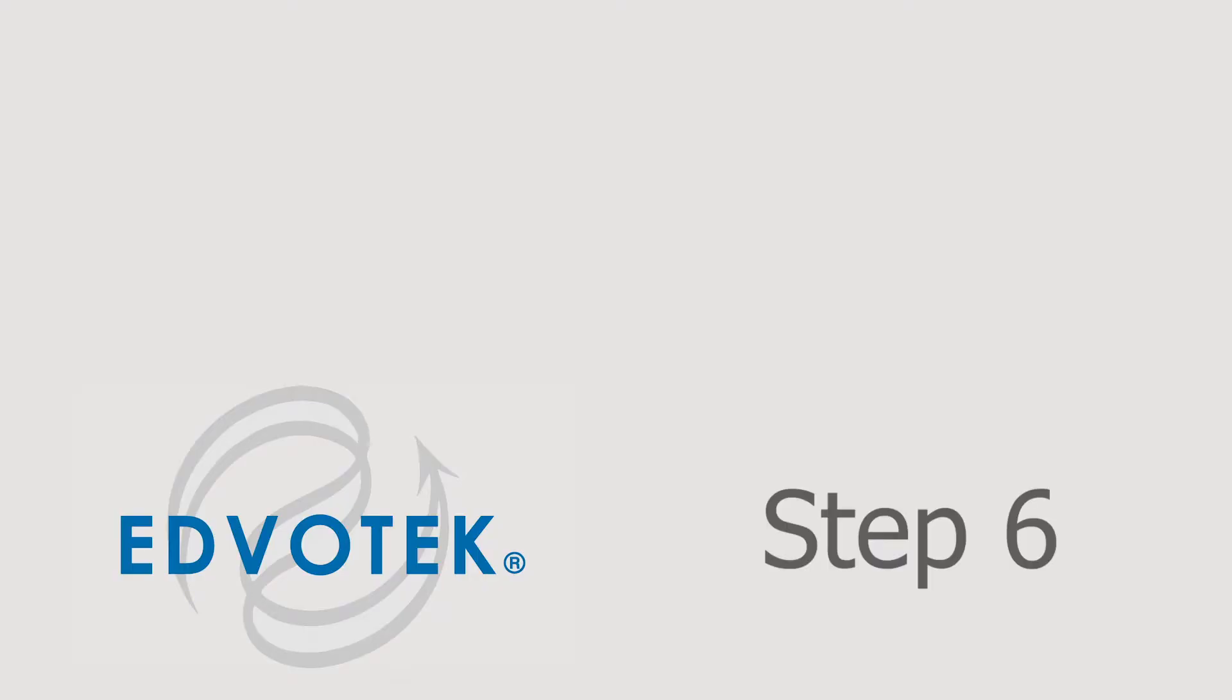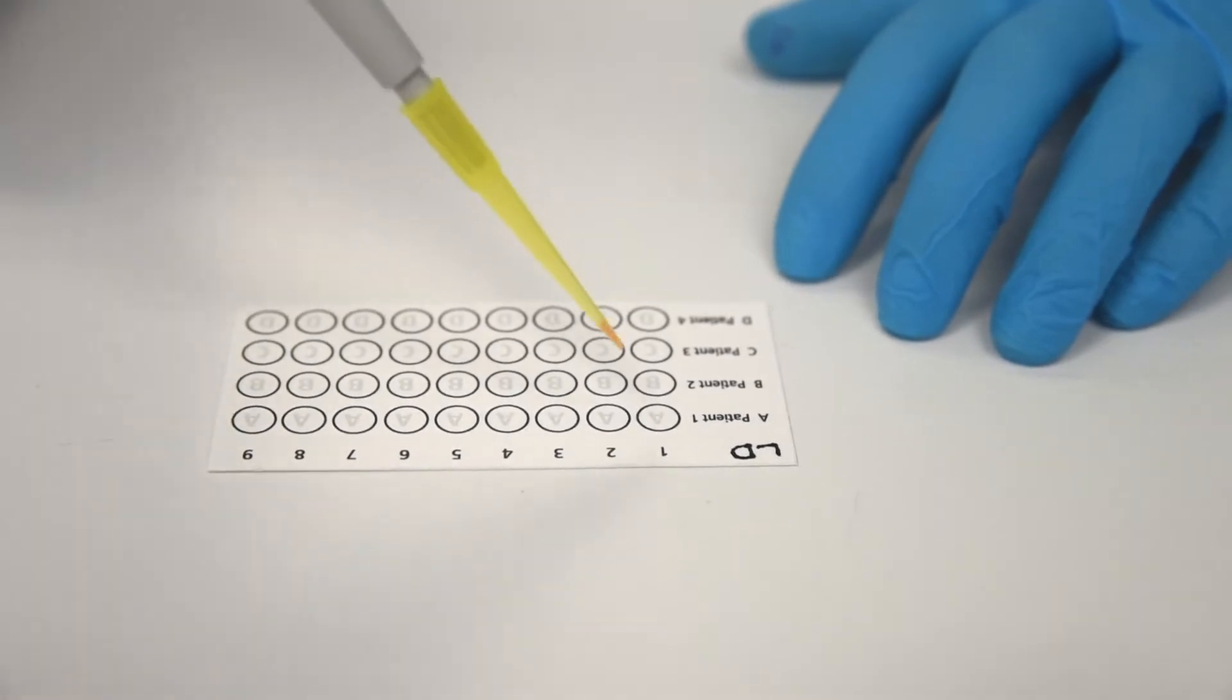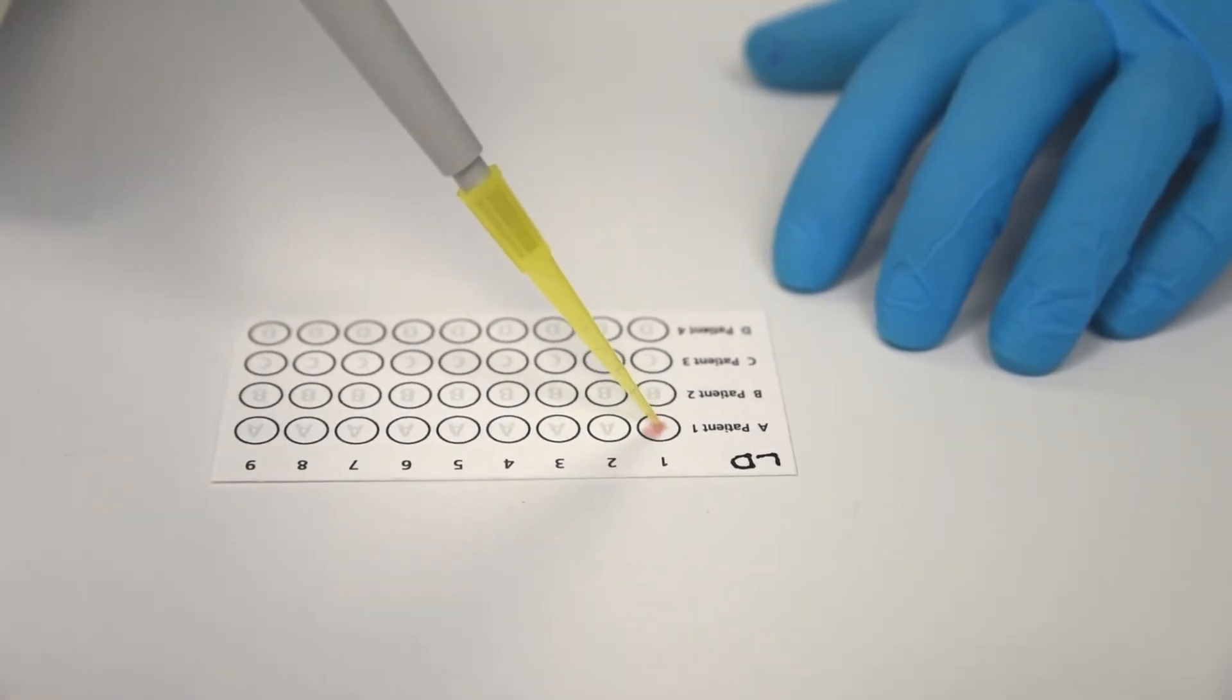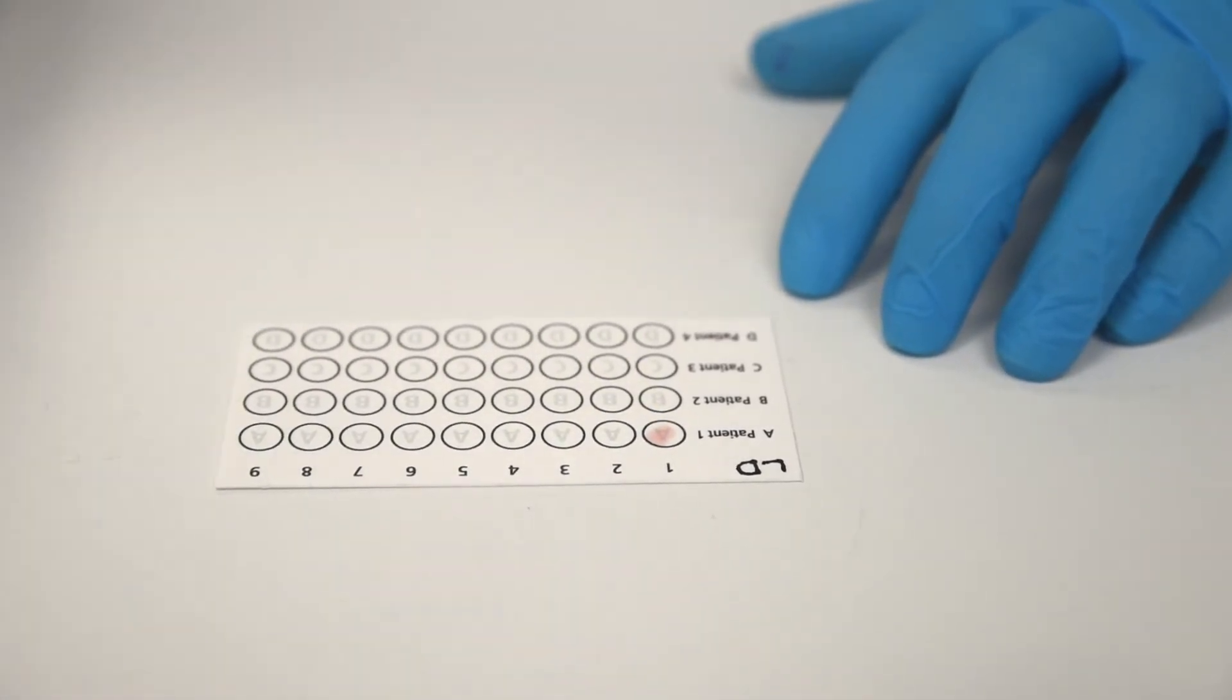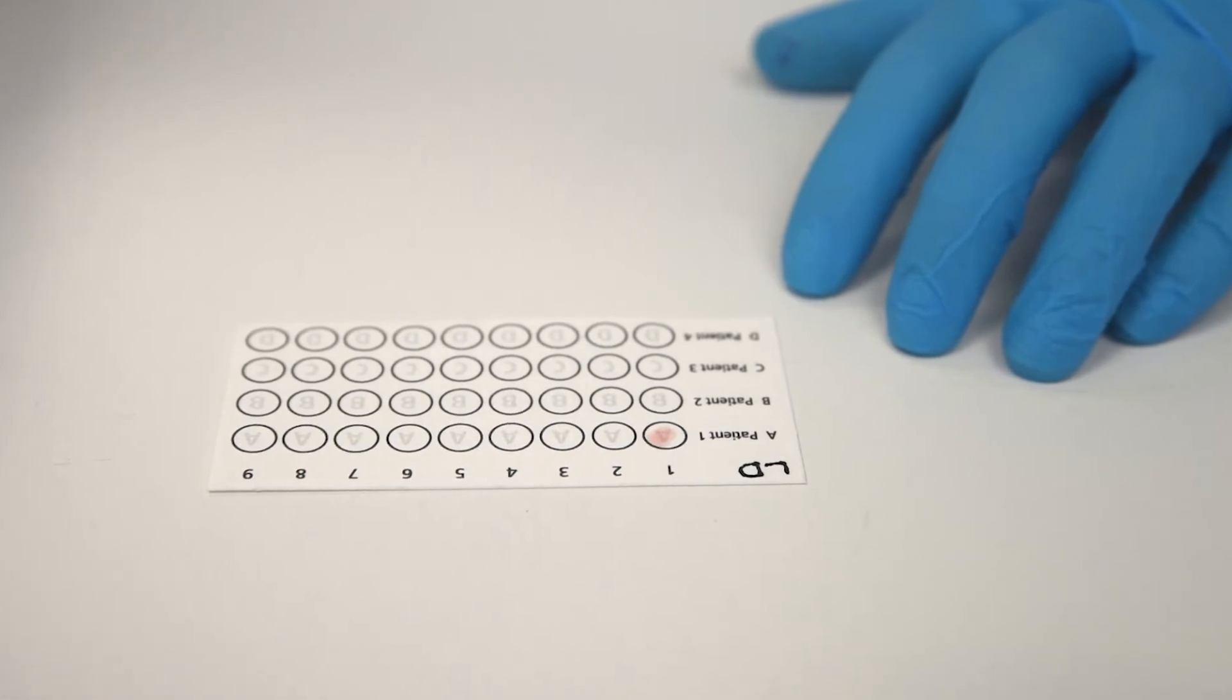Step 6. Still using the same micropipette tip, apply 5 microliters of the mixed sample to the top left spot of the microarray card.